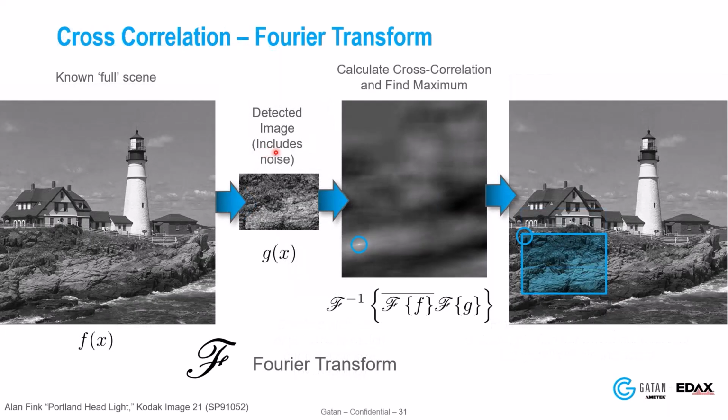What I want to start talking about now is spherical indexing. And so this is the same image, and what we're trying to do is we take our same master pattern, the large area, here's our detected image, but now we're going to compare it in frequency space, basically passing this image along the master pattern and finding the highest peak of correlation, which tells us where it belongs in that image. Okay, so that's a 2D representation.